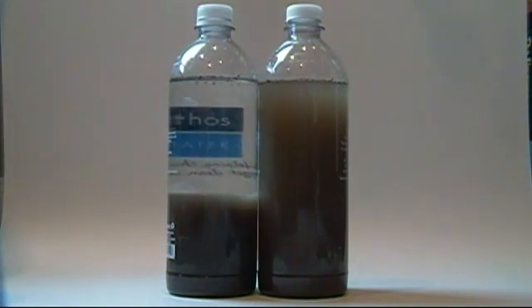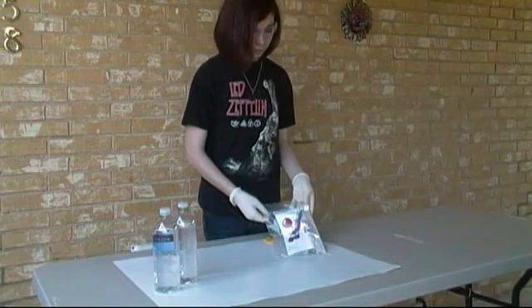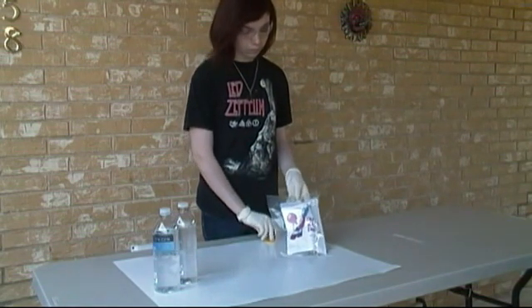A flocculent is a substance that promotes the clumping of particles. They use them to treat wastewater, which, to tell you the truth, I really don't even want to think about. Anyway, I'm using the water purification kit purchased from ChemKitDepot.com.